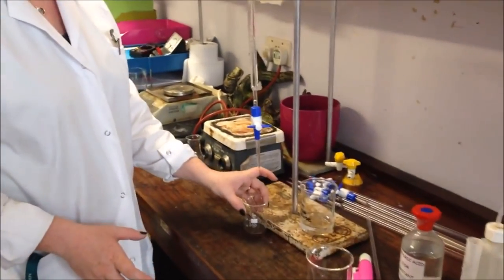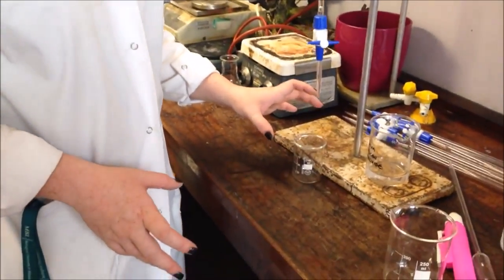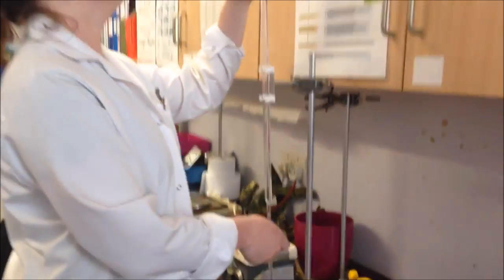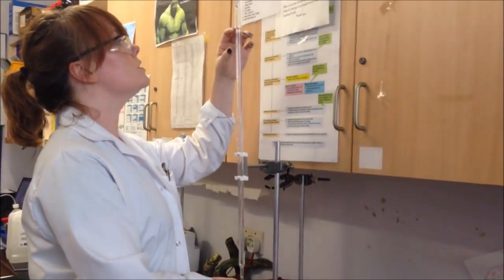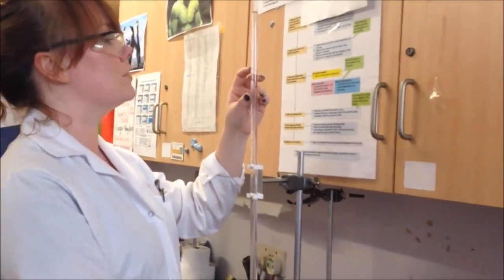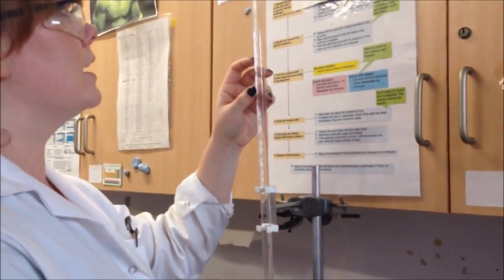For the iodine clock, the first thing we need is 10cm³ of hydrogen peroxide, and I'm going to measure this out using a burette. I'm going to see what the initial reading is, work out where I need to get to for the end point, and then run it through into the beaker.